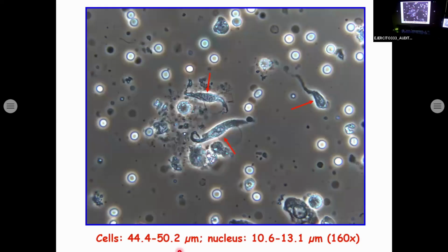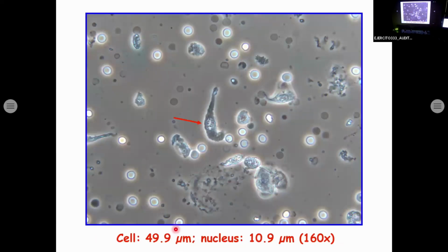And this is at a low magnification. Then we have another type of cell like this, an elongated cell with 2 large nuclei. And here, normal transitional cell, red blood cells isomorphic.